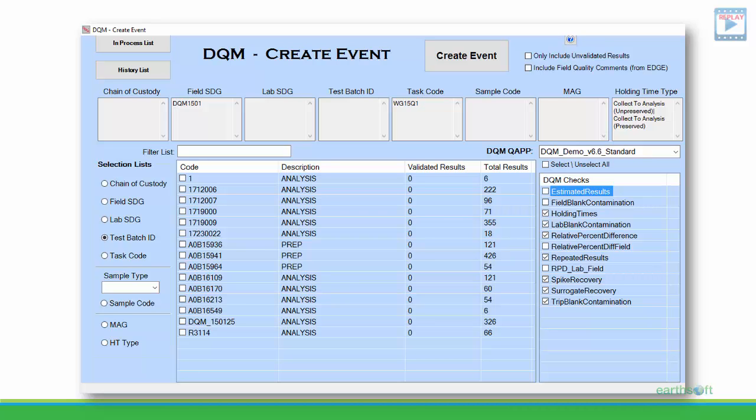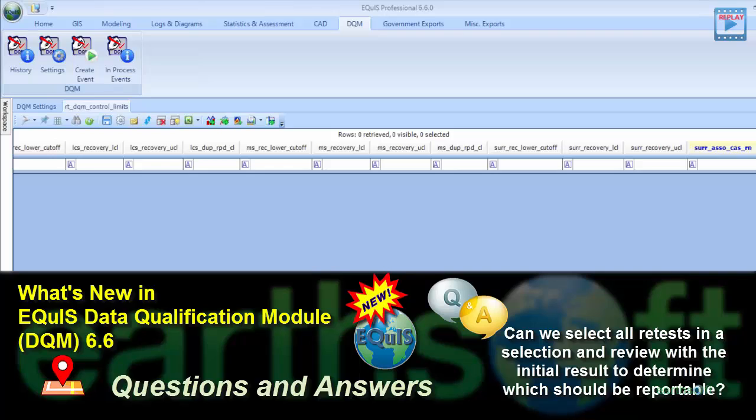All right, excellent. Thanks, Jim. Kevin asks, can we select all retests in a selection and review the initial results to determine which should be reportable? That's a good question, Kevin. It sort of depends.